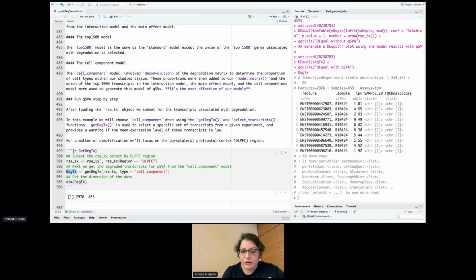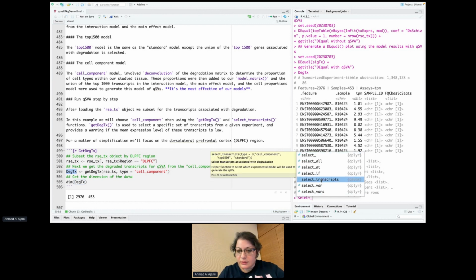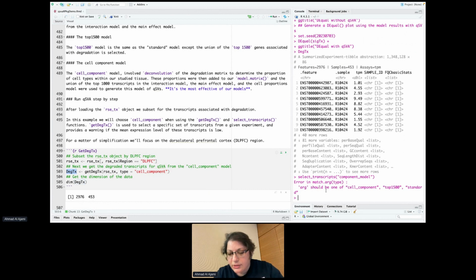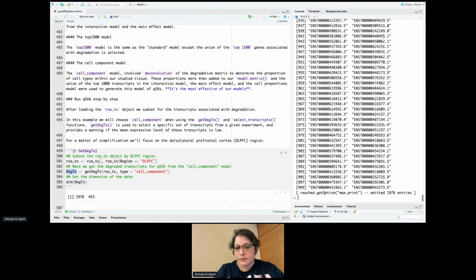If we have a look at select transcript and we put cell component, you will see that we have here the list of transcripts that we've got from our analysis that are associated with degradation.